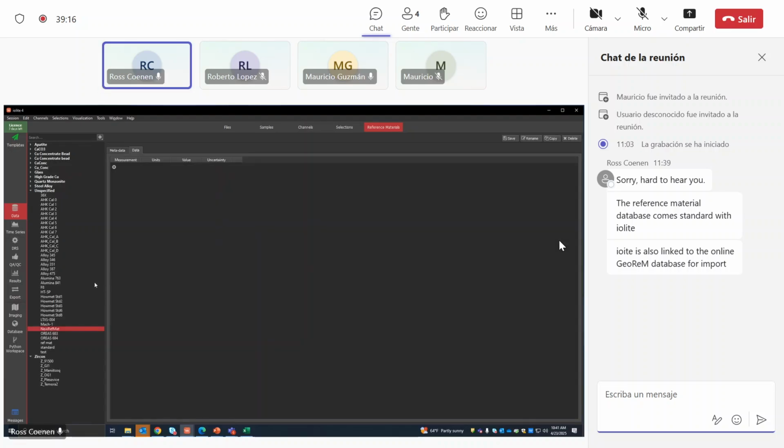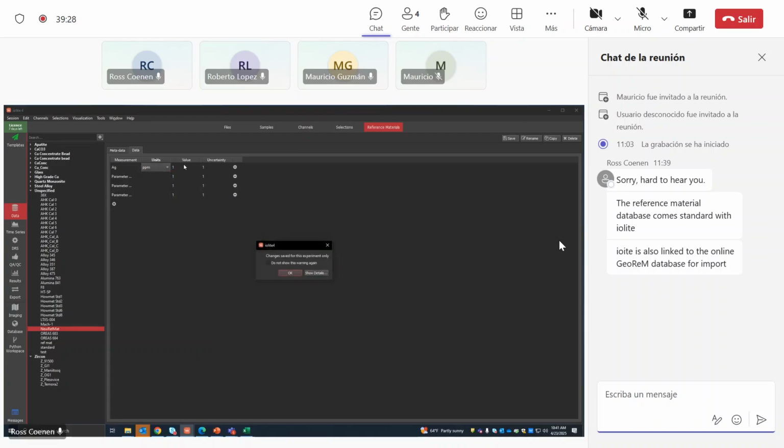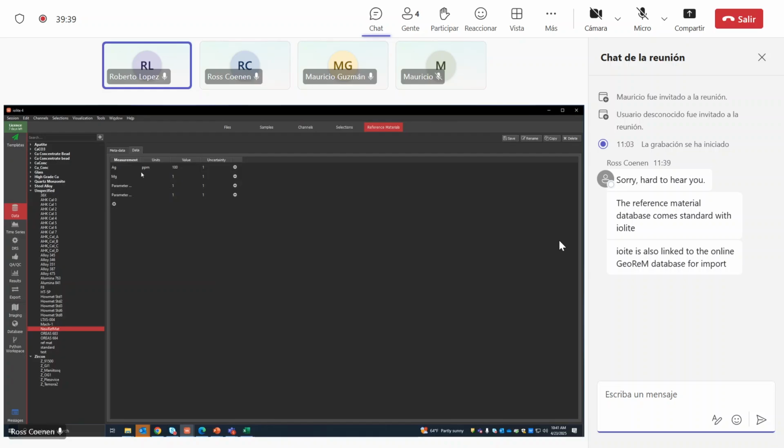So new reference, and then you can add, you know, and so on.